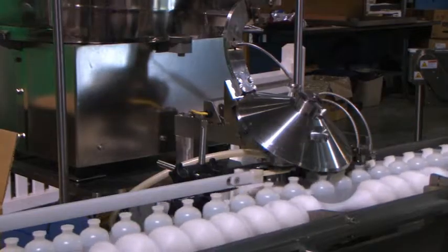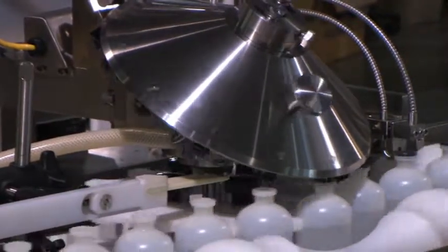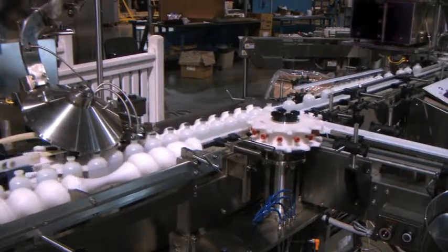The RS400 uses an inclined rotary stoppering head. This can fully or partially insert stoppers. The vacuum star wheel removes rejected bottles from the line.